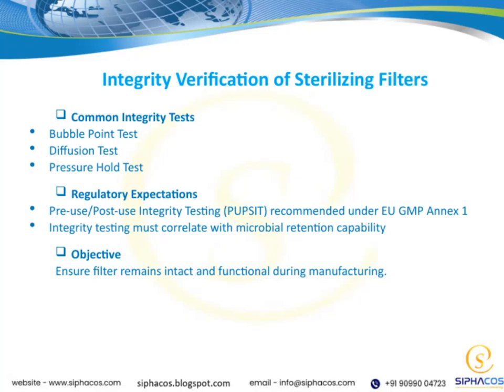Now, let's talk about the integrity verification of sterilizing filters. When we perform integrity tests, there are a few common ones to keep in mind.